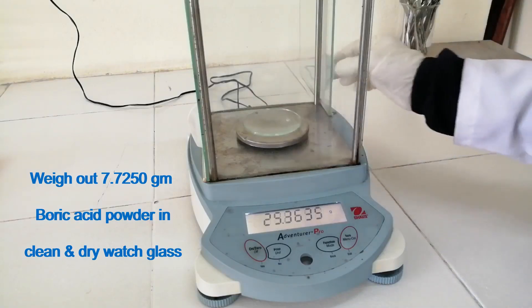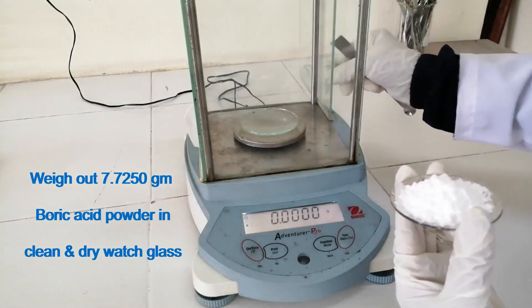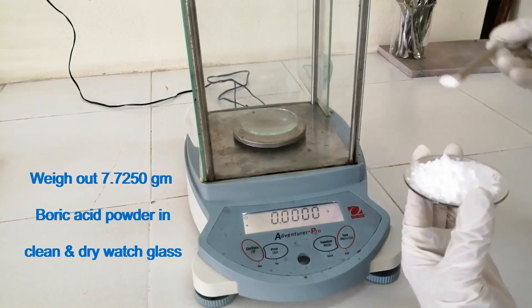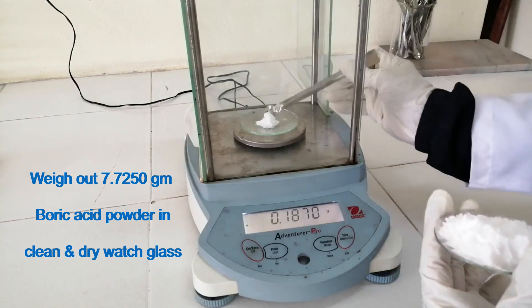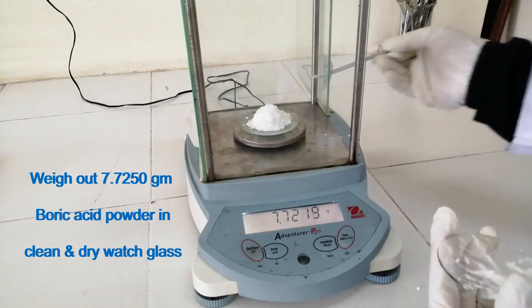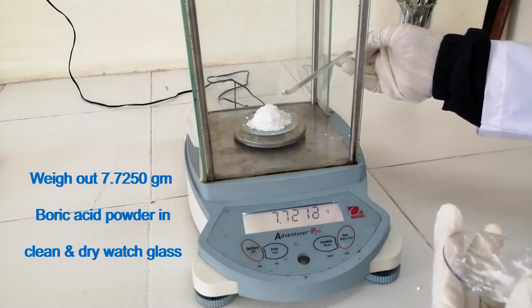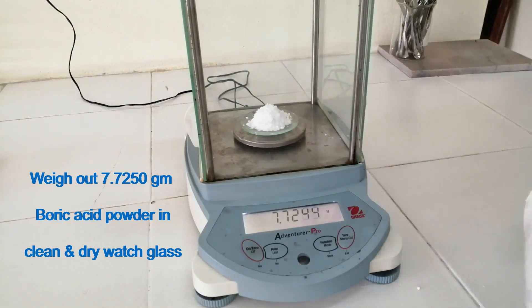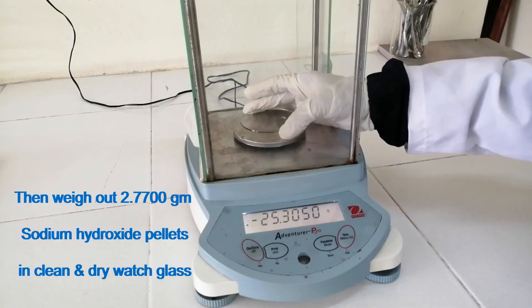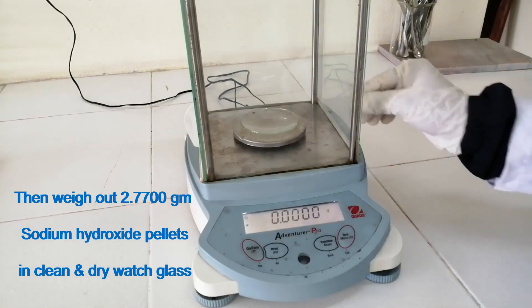Weigh out 7.7250 grams of boric acid powder in a clean and dry wash glass. Then weigh out 2.77 grams of sodium hydroxide pellets in a clean and dry wash glass.